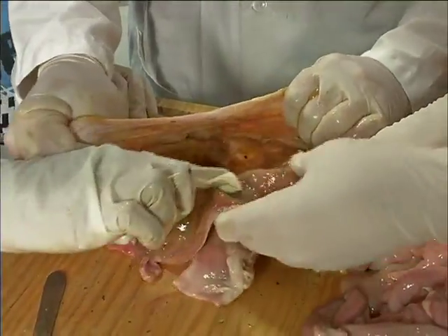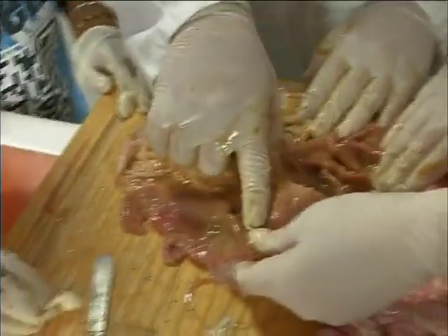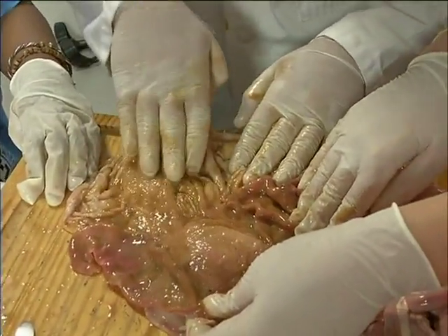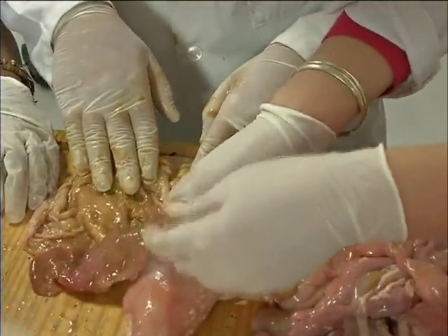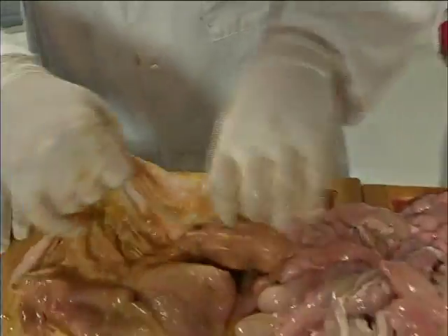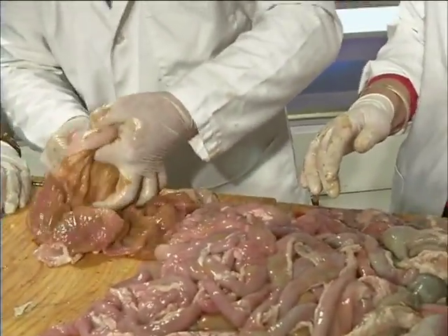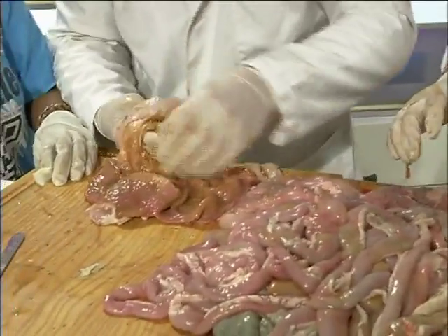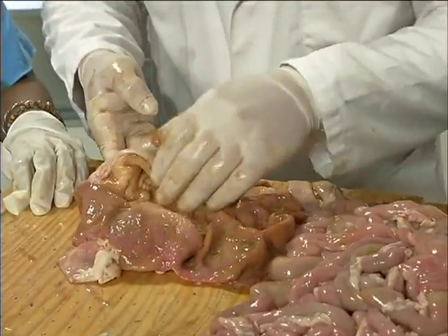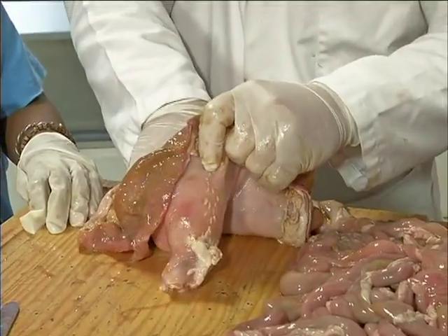I'm just going to tear this now. It looks like this. It's exactly the same. Let's understand that digestion does take place in the stomach, but not much. Oh, wait, this is the one that goes to the small intestine. Now, watch this carefully. If I have a look, there's the inside part. Okay, I'm going to try and get my finger through there. There we go. That's where it came from, the esophagus. Can you see? Then it goes into the stomach, and it churns, and then it comes out through there.